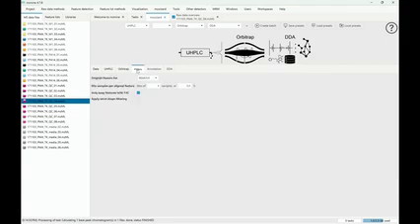And filters, we're going to set to remove. So in the filters tab, there's original feature list, remove. Then minimum samples per aligned feature. We do have some replicates here, and we also do want to do some statistics, so it's always good to have maybe 3 samples, or you could also say 10% of your samples need to have a feature to be considered for the downstream analysis.